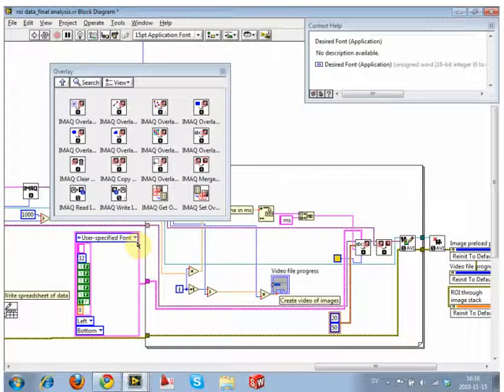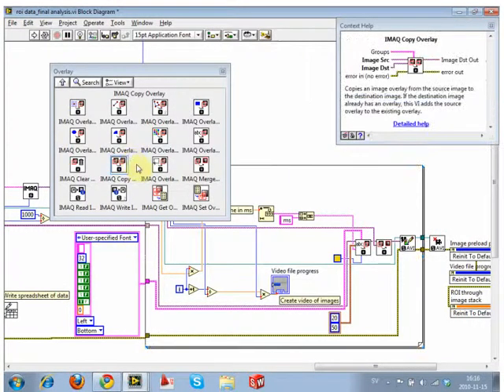However, just like in Photoshop, it treats each overlay as like a new layer. Your original image kind of hovers below, and it's treated like a locked background. You can't edit that using overlays. When you construct an overlay, you're just sticking layers on top of this image, but your original image is not modified at all.